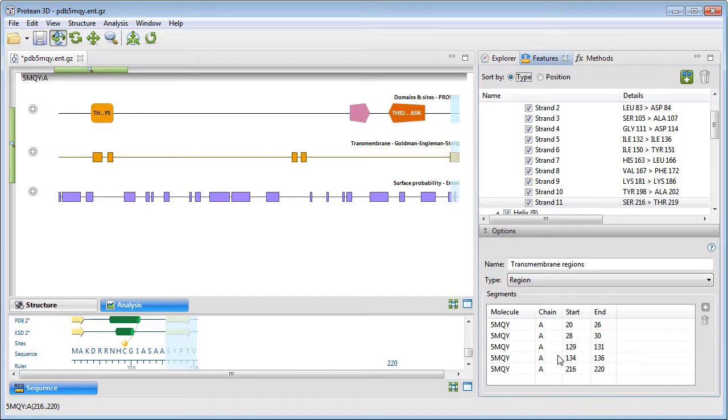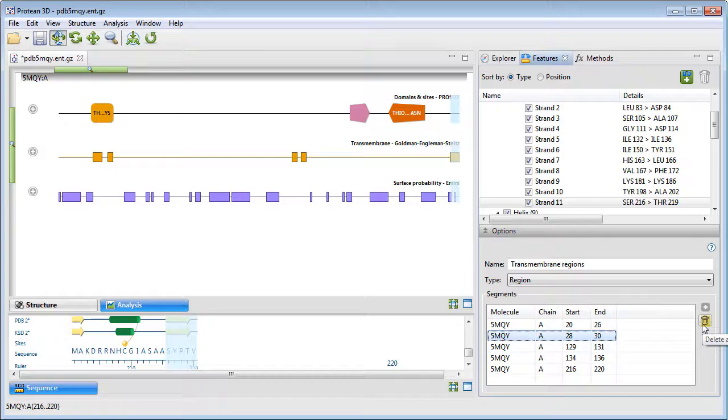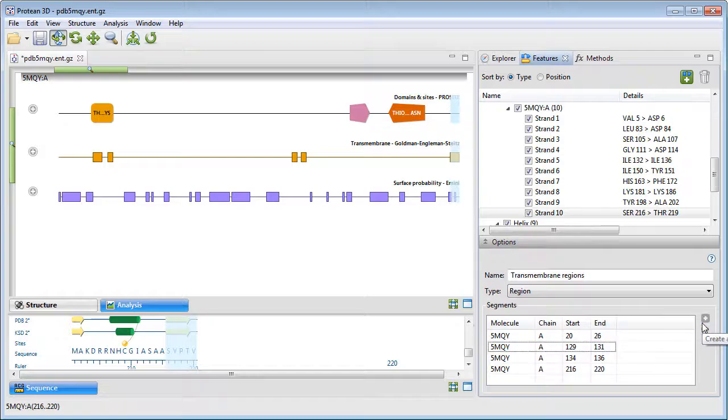To remove a segment, I can select it from the list and choose Delete a Segment.